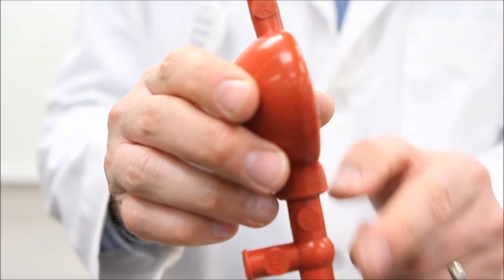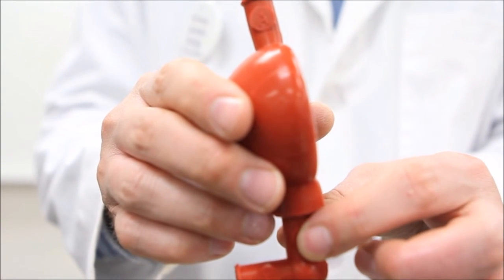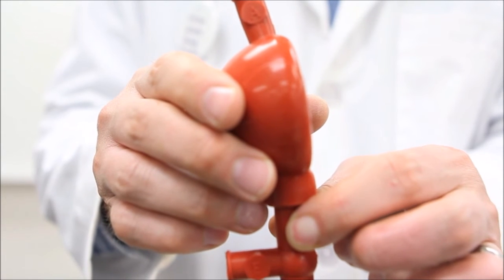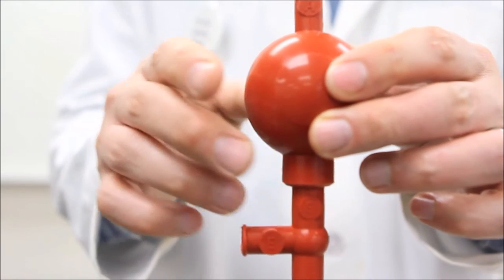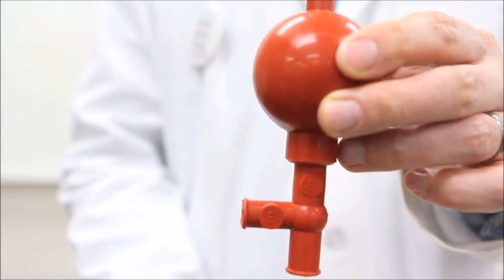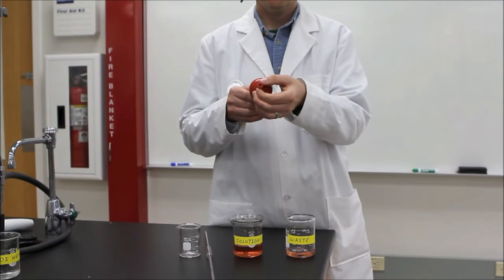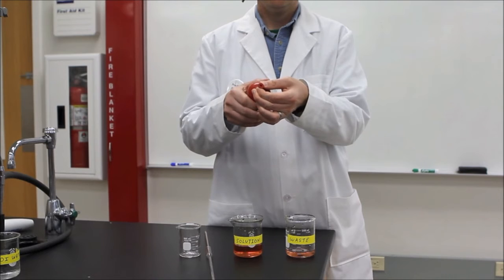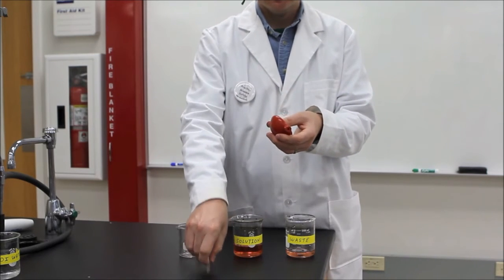Pinching the S valve provides suction of the liquid into the pipette and consequently reinflates the bulb. Pinching the E valve empties the liquid out of the pipette in a controlled fashion. First, pinch the A valve while simultaneously squeezing the bulb. After the bulb is fully squeezed, release the A valve and affix the bulb to the mouth of the pipette.